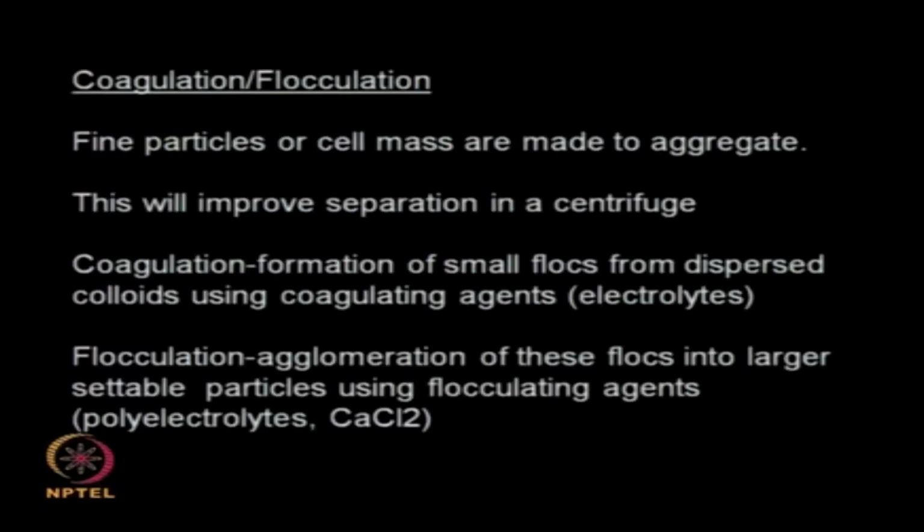So if you have a situation where you have an organic molecule and you have some unwanted proteins where you are more interested in the organic molecule, then heating is very good. But if you are interested in the protein part of it, then you are in trouble, because you cannot raise it to such a large temperature, and most of the proteins will completely get denatured.